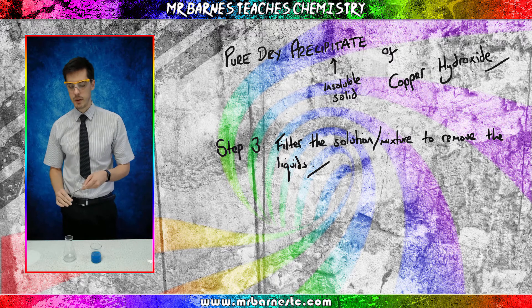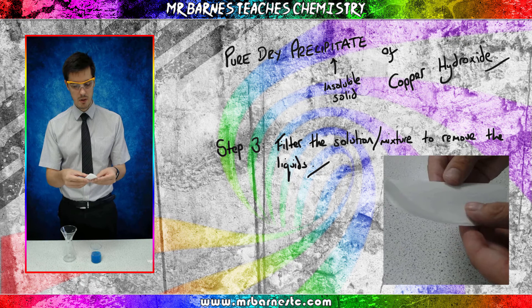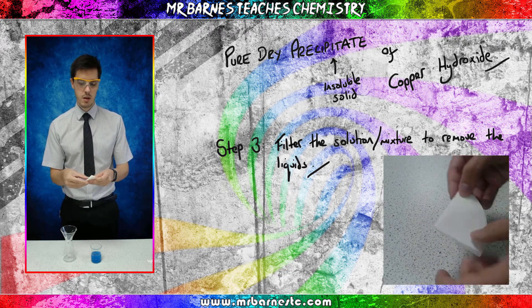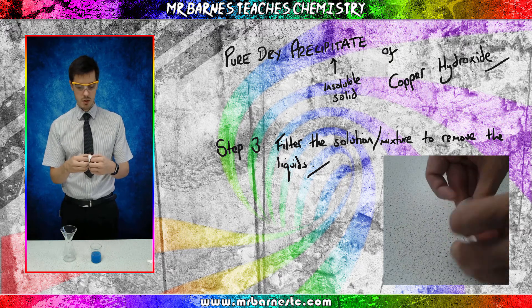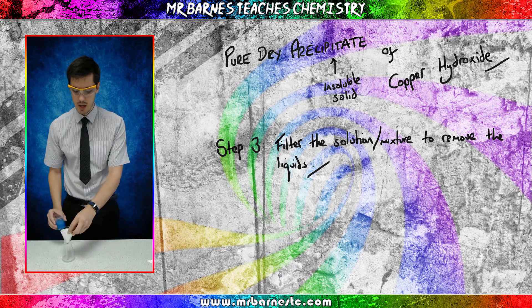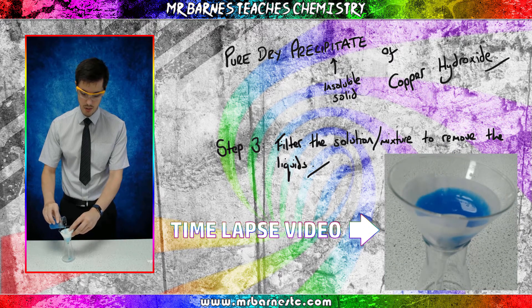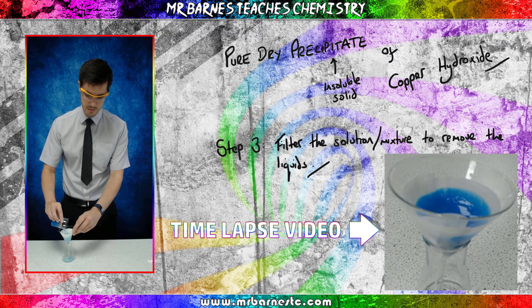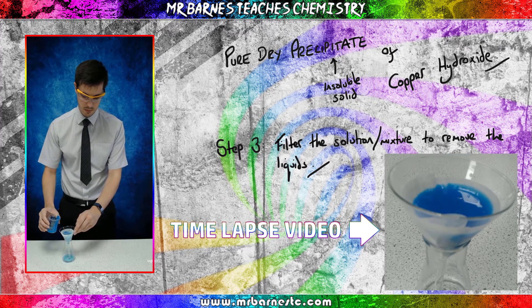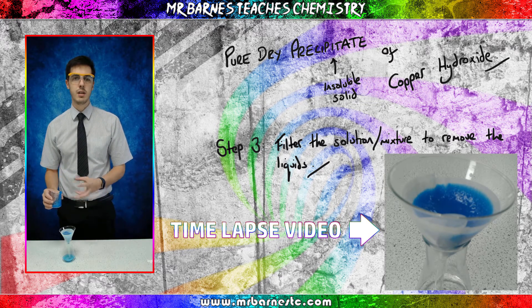To filter, we get a filter funnel and filter paper. We fold the filter paper in half, in half again, and open it out by one of the tabs. Place it in, take your mixture, and very slowly pour it in, making sure it doesn't go above the filter paper line. You'll also want to get a bit of distilled water to rinse in any solids that are left.